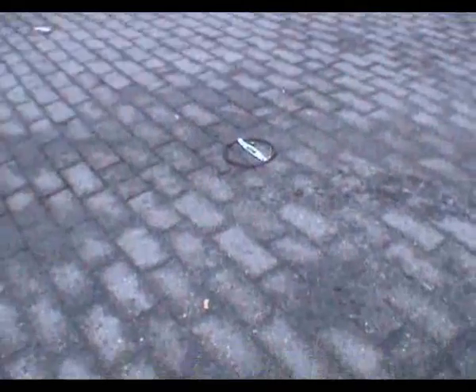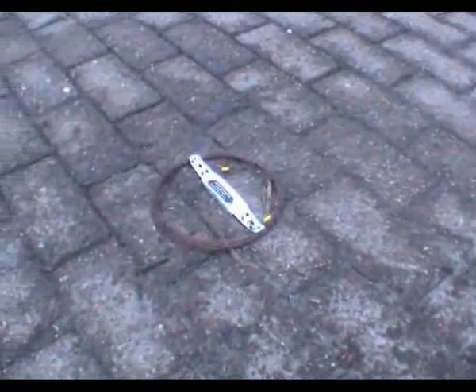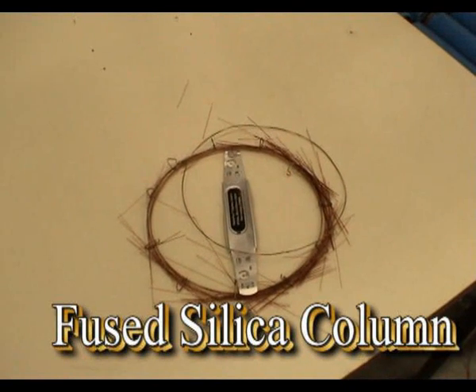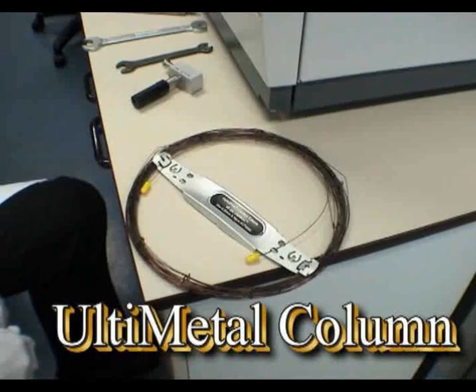This is what the columns look like after being run over. As you might expect, the fused silica column is smashed. But look at the Ultimetal column — it looks undamaged.